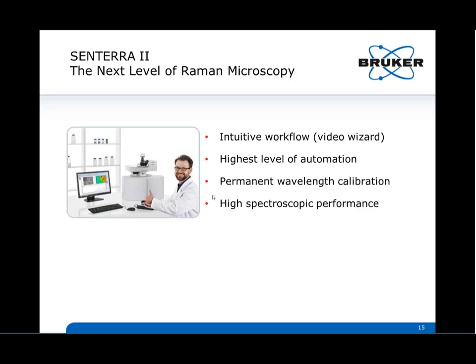One part of the concept is the wavelength calibration, which is valid and acting at any stage of instrument operation. So the user can focus on the measurement task completely and is not hindered by any tedious procedures of calibration and tweaking. And last but not least, SENTERRA also provides a very high spectroscopic performance.